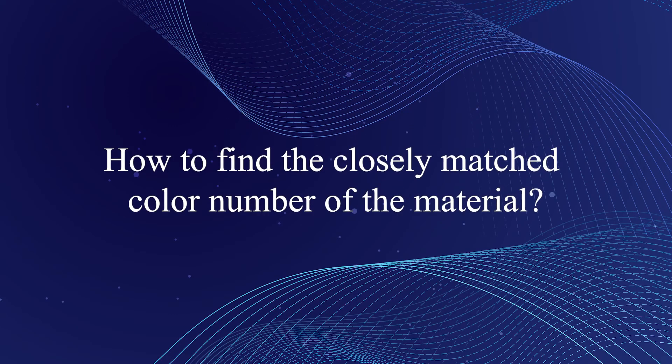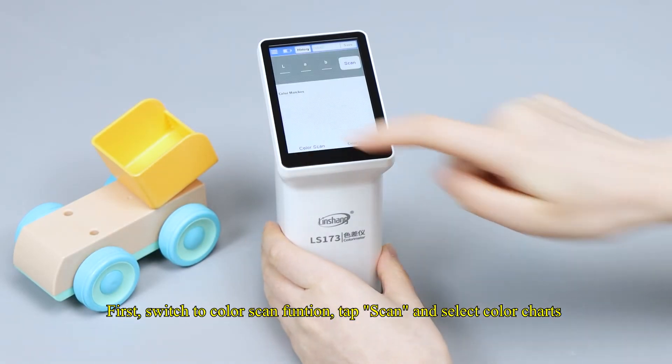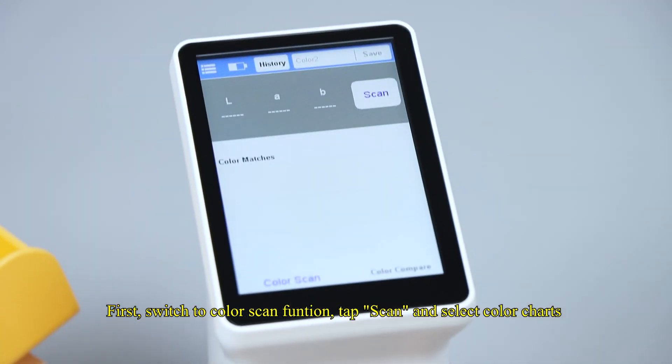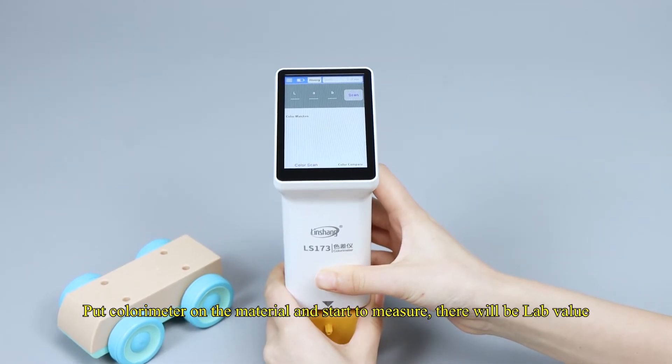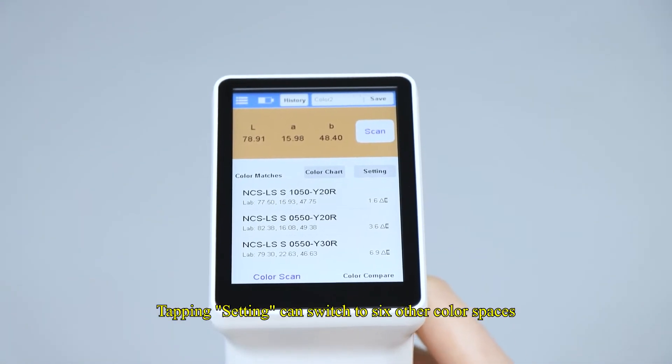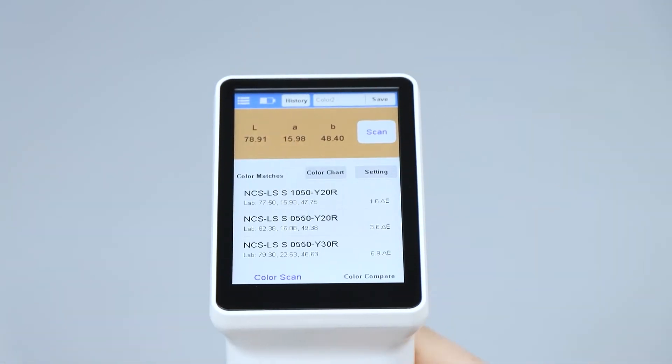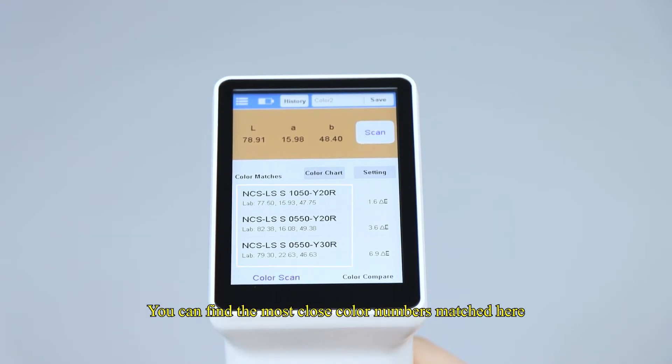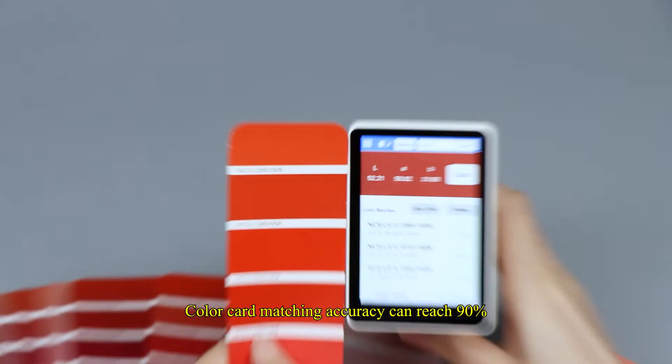How to find the closely matched color number of the material. First, switch to color scan function, tap scan and select color charts. Put colorimeter on the material and start to measure, there will be LAB value. Tapping setting can switch to six other color spaces. You can find the most close color numbers matched here. Color card matching accuracy can reach 90%.